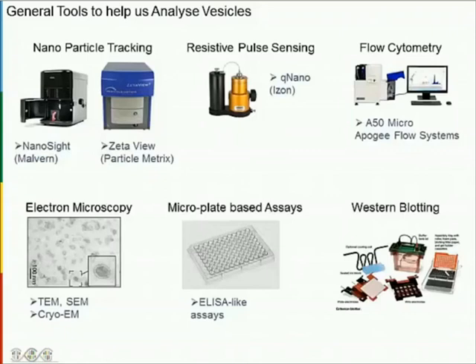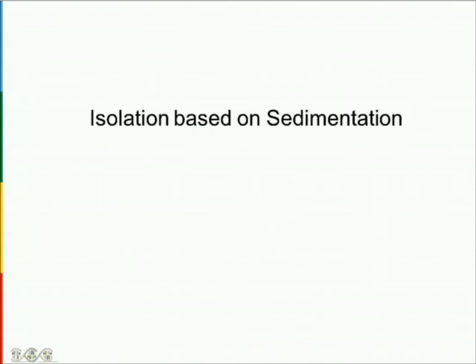So let's think about these vesicles in terms of their sedimentation characteristics, and maybe we can use centrifugation to spin them out of solution, for example.